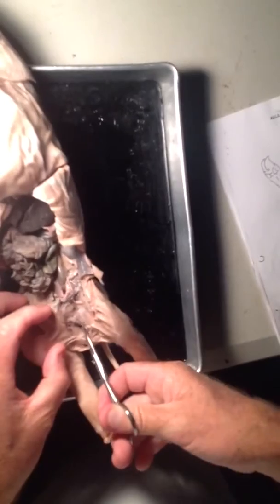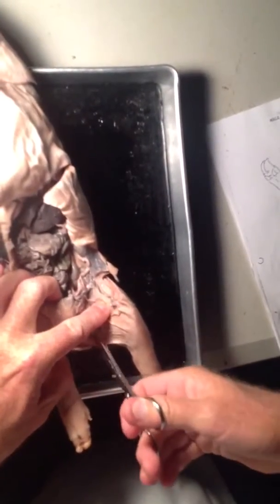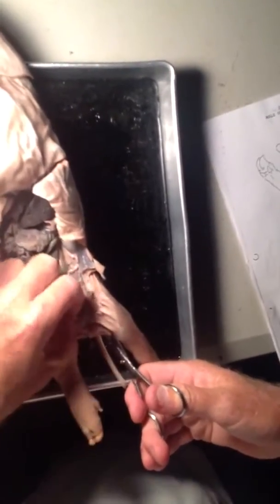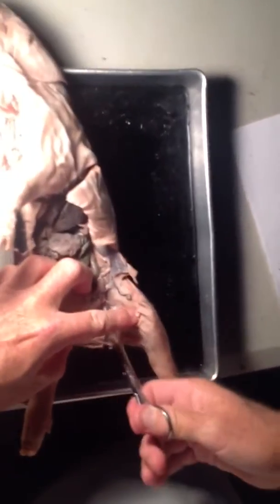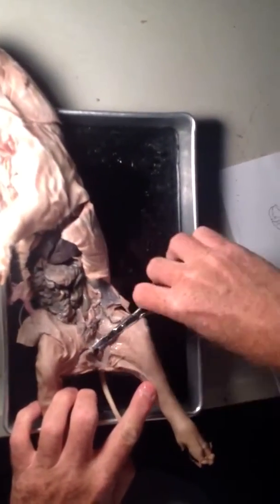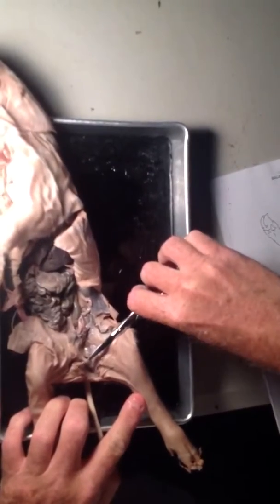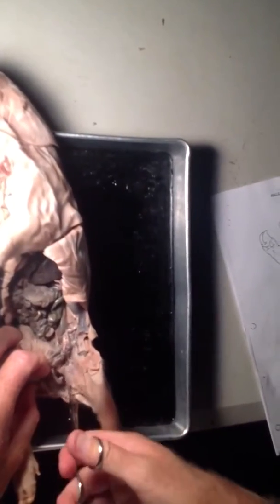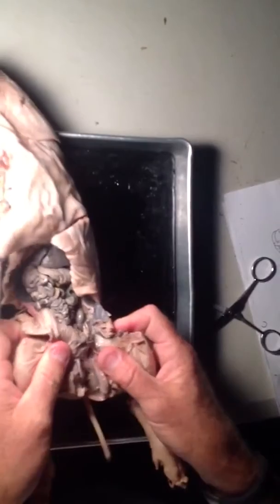Guys get upset about this. Girls, for some reason, when you split their hips open, go 'oh, cool.' Guys are like, 'it looks like it hurt.' And then I can reach in and pull out — if it decides to cooperate. Right there. There's what I'm looking for — that little guy right there. That would be the testy.